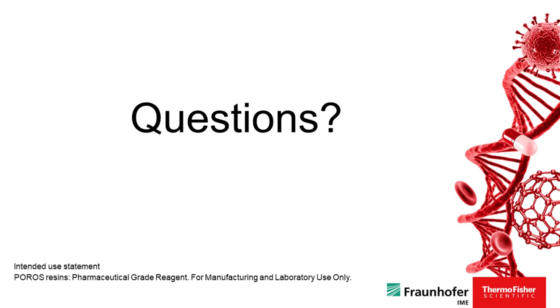The last question for the webcast is, what size plasmids have been purified by the D50 resin, and would this resin be suitable for purification of larger plasmids, such as larger than 20 kbp? Right now, as I mentioned, we've only looked at this 5.3 kilobase pair plasmid with our current collaboration with Fraunhofer. However, we're looking to add additional work to purifying larger plasmid constructs, such as 20 kilobase pairs and larger.